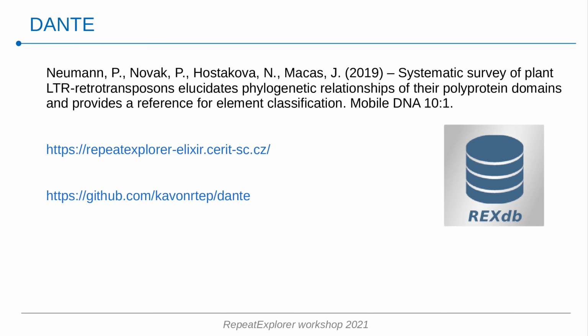If you use the DANTE program, please cite Pavel Neumann's paper, which describes the transposable element annotation system, and also our RepeatExplorer server. Source code and the command line version and also basic documentation for DANTE are available on GitHub.